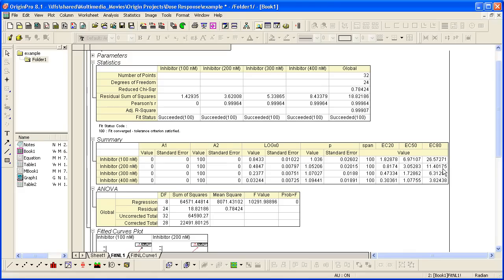The term half-maximal effective concentration, or EC50, refers to the concentration of a substrate, dose, which induces halfway between the minimum and maximum responses. The effective concentration, or inhibitory concentration, are critical values in dose response analysis.